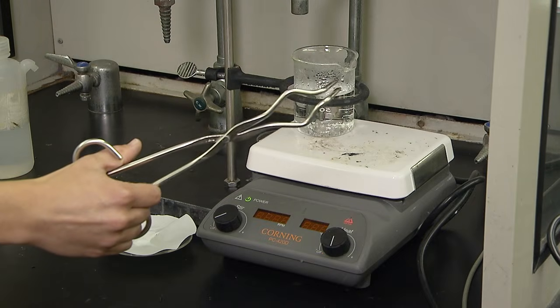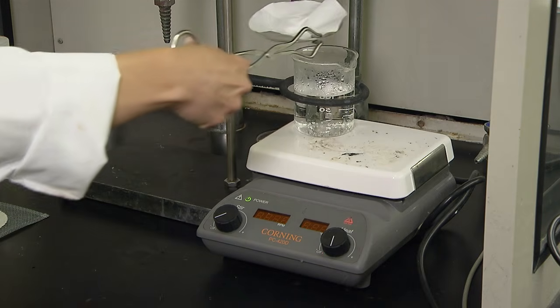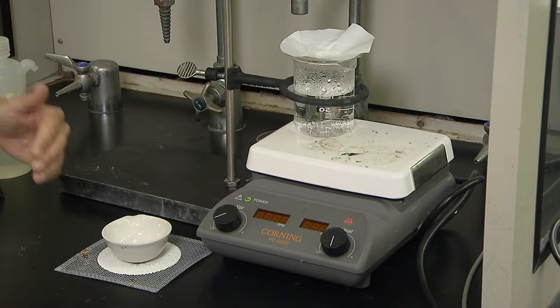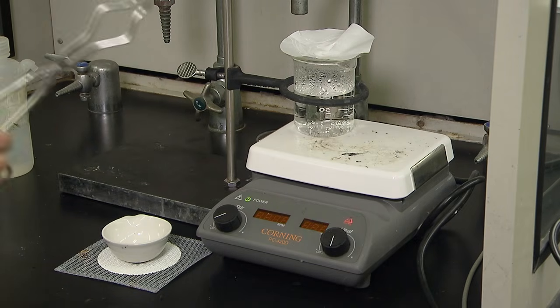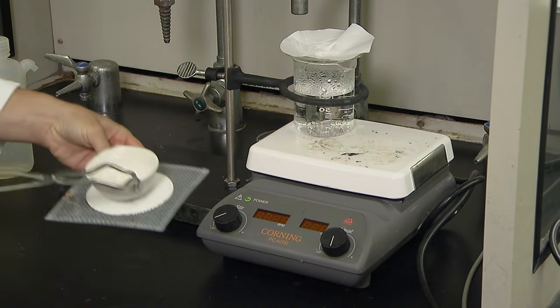The filter paper with the calcium carbonate is on the watch glass. This can be set on the water bath to dry using crucible tongs. All glassware will need to cool on a heat-resistant mat before the mass can be measured. If you can hold your hand close and not feel heat, it is cool enough. This one is ready. Use the appropriate tongs to transport the glassware to the balance. Watch the How to Handle Hot Glassware video for more detailed information.